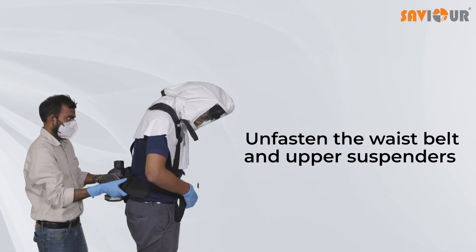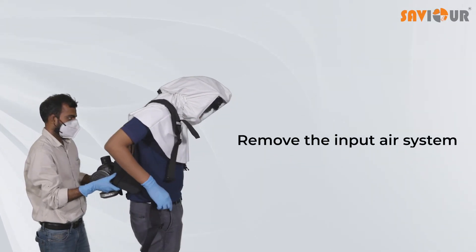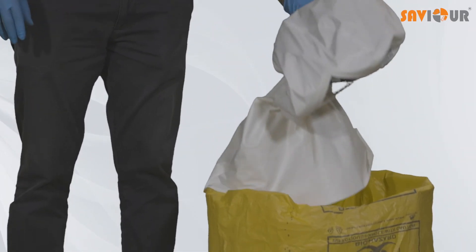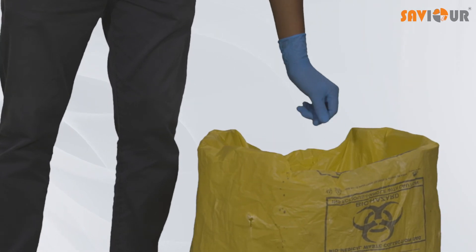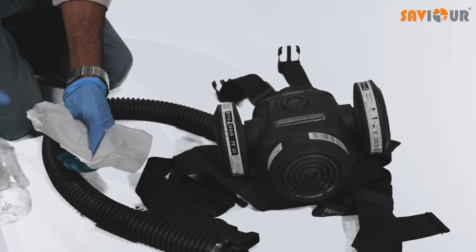Unfasten the waist belt and upper suspenders, and remove the input air system. Carefully take off the hood and put it in a sealed bag to be sent for decontamination so that it can be reused. Disinfect the input air system as per protocol.